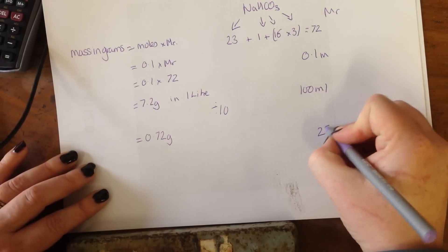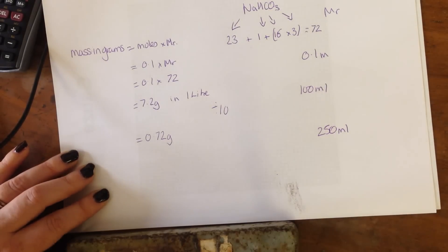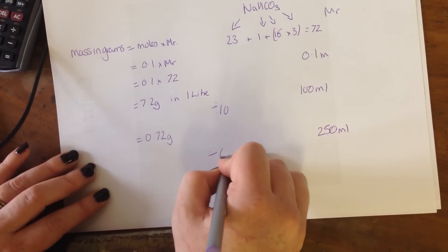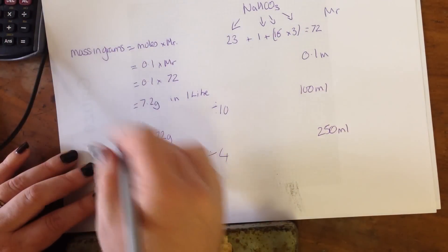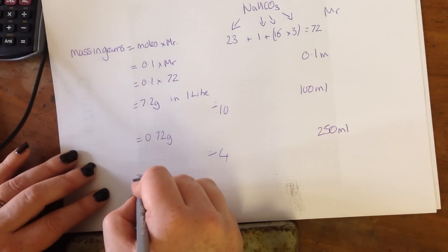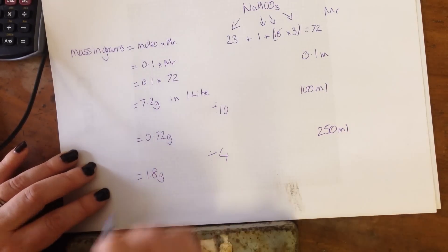If I wanted to make a 250 ml solution, I would just divide that by 4. So 7.2 divided by 4 equals 1.8 grams.